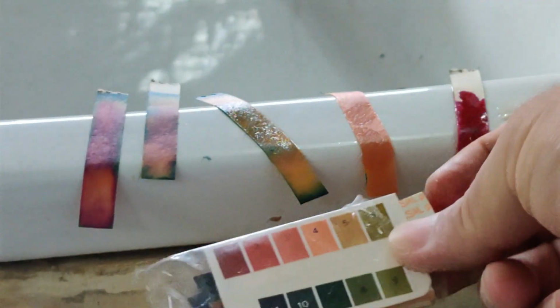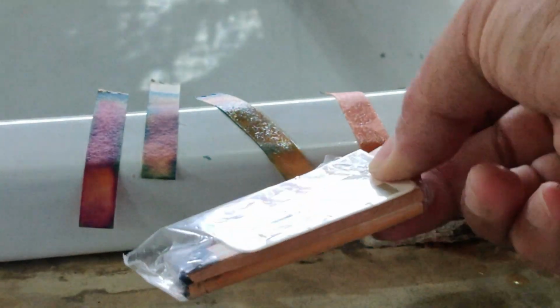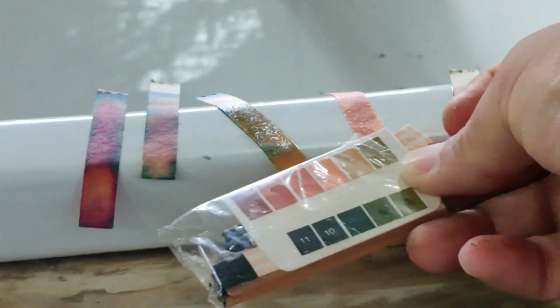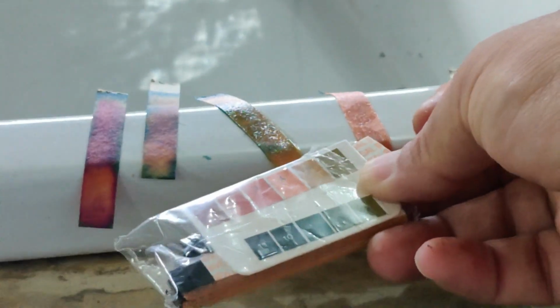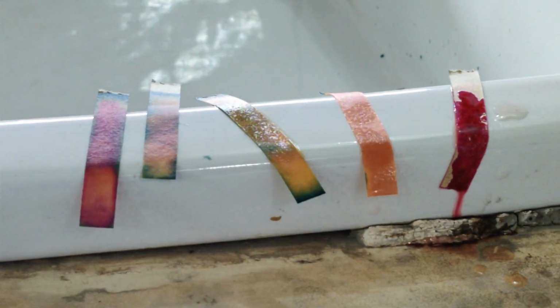So this one was matching a somewhat greenish, if you can look at this one, greenish, and somewhat if you look at that side, I think I had added acid somewhere here. So I think we should compare that color. I think it is showing something like this, 5, that is also acidic. And if you go to that, that was more towards a bluish side, greenish side, you can match like this. So those were 2 bases. So these were bases, and this is how actually we use the indicator, the universal indicator, to detect the pH value of different solutions. So that was about the chapter acid, base and salt.